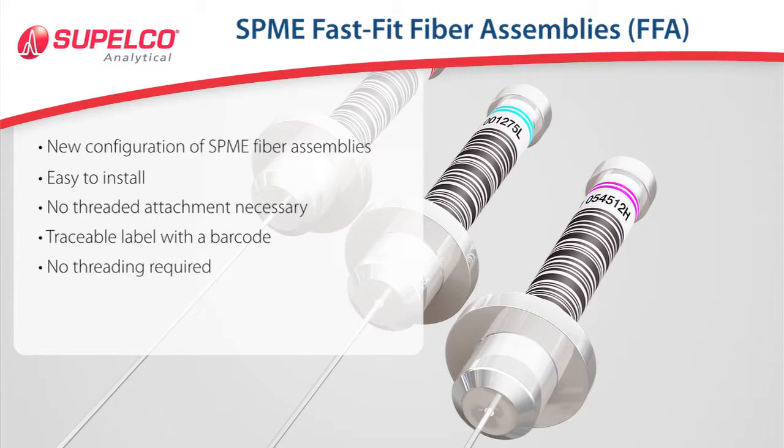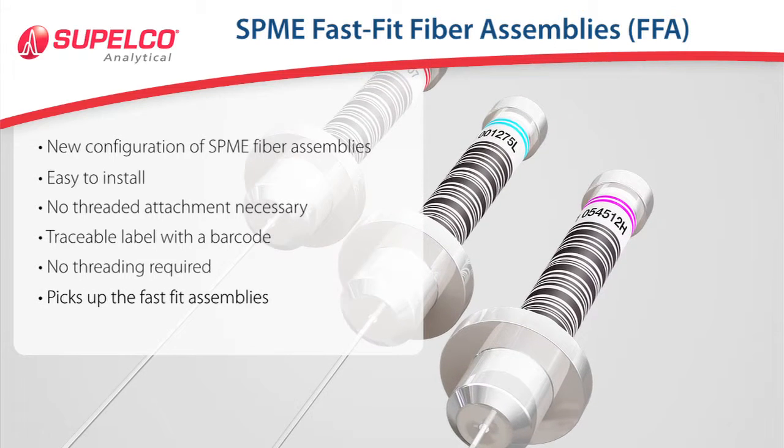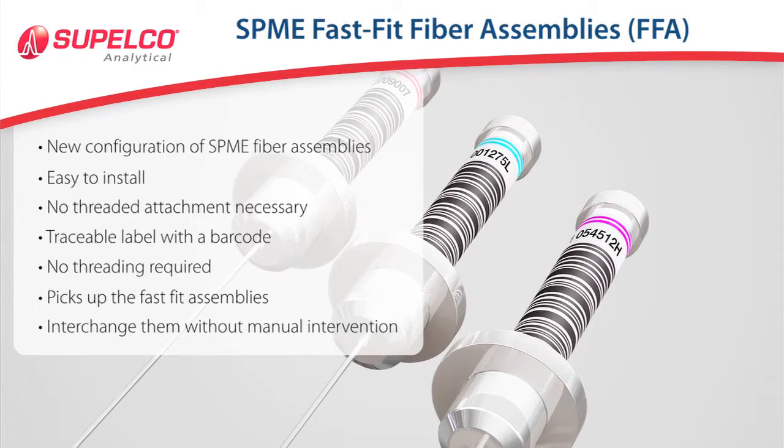The AutoSampler Multi-Fiber Exchanger can pick up the Fast Fit Assemblies and interchange them without manual intervention.